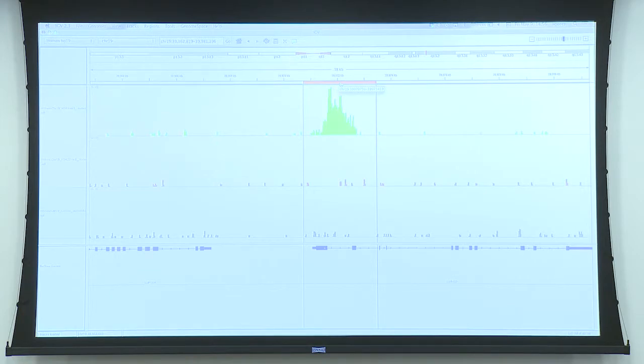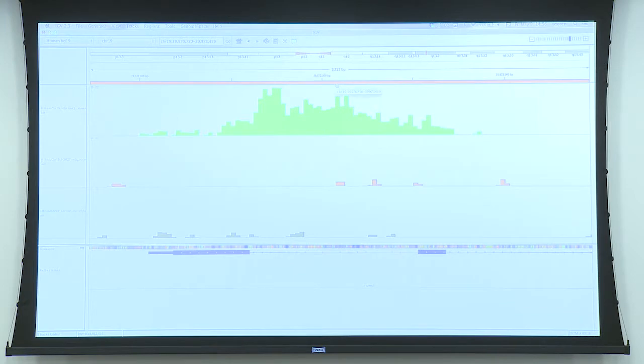The other thing is that if I double click on it, I can zoom on it. I can copy the sequence to my clipboard. I can edit the description, or I can delete the red line. So this is a nice feature of IGV. And again, I can talk forever about IGV. I want you to do some more stuff, but look into IGV. I found IGV one of the best tools to view the genome and do points in it.